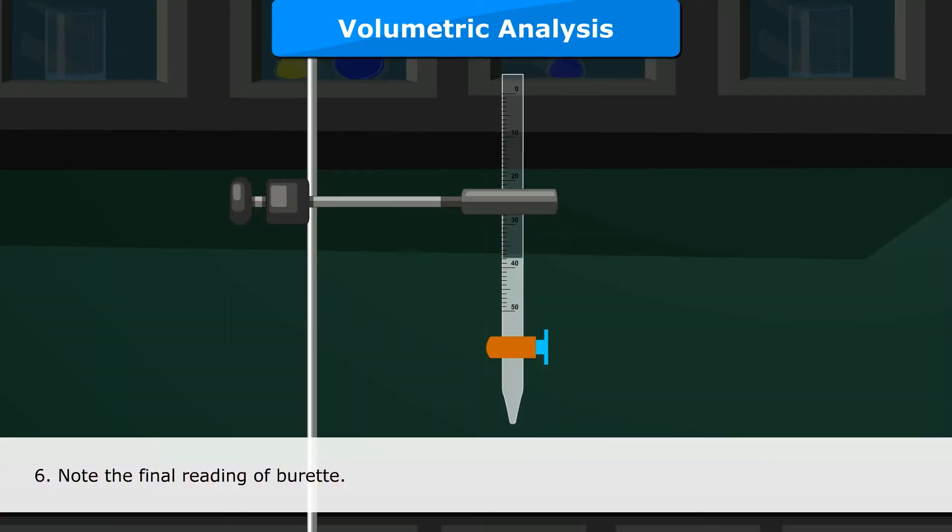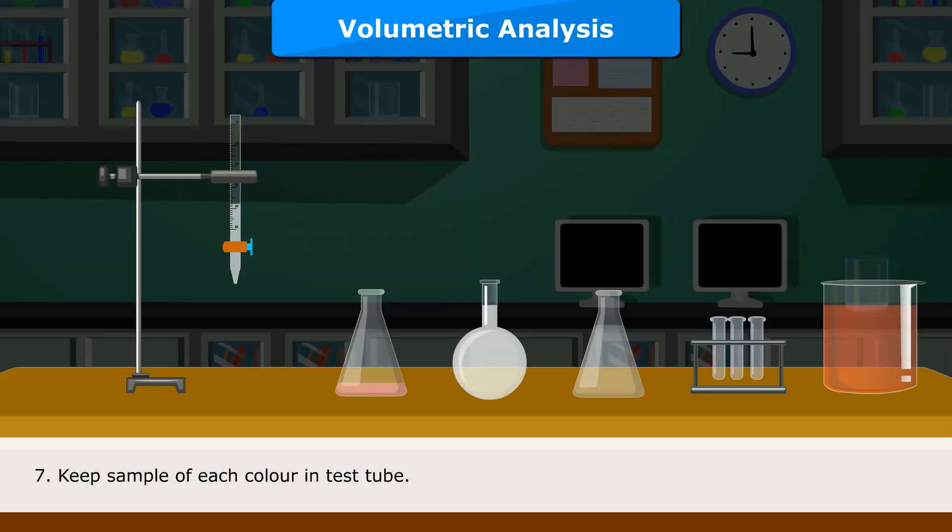Note the final reading of Buret. Keep sample of each color in test tube.